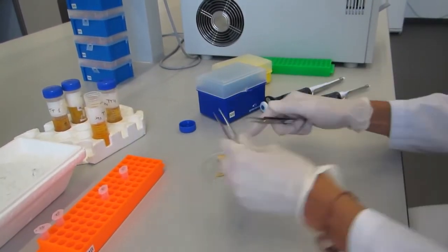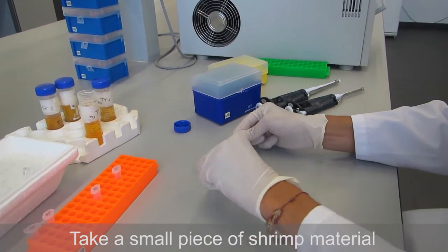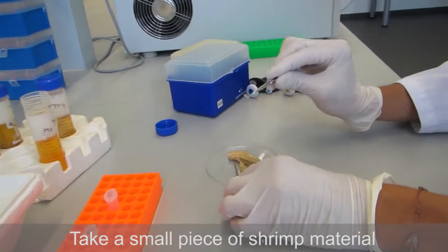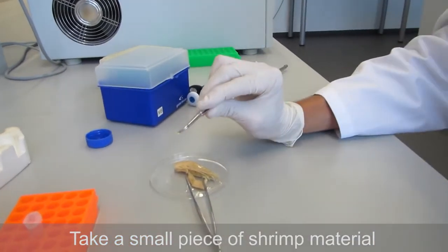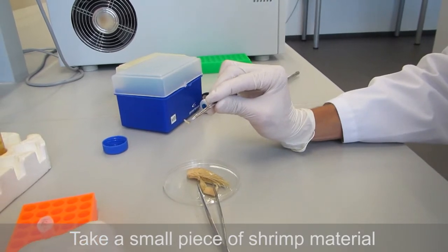For today we will take only a small piece of this leg. It's a small swimming leg, a pleopod of the seabob shrimp. And from this part we will extract the DNA.